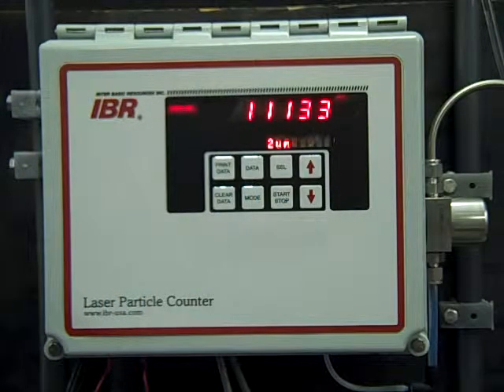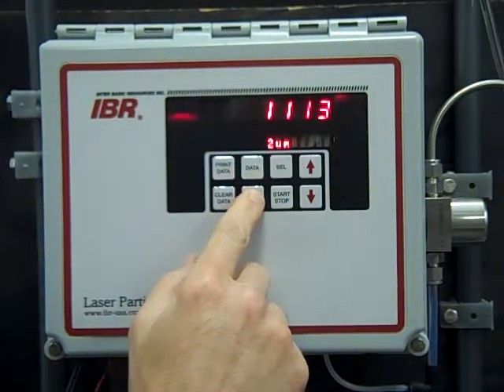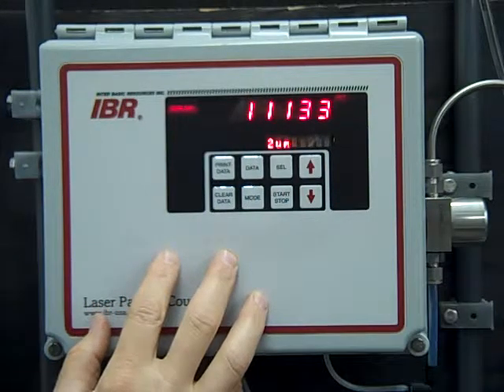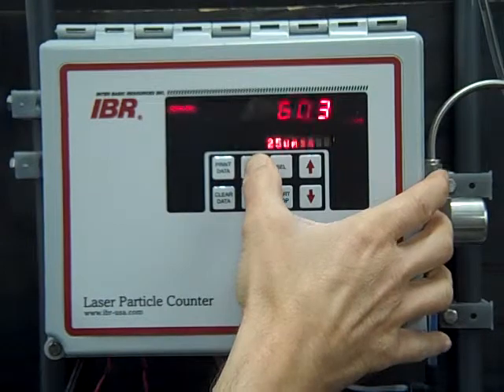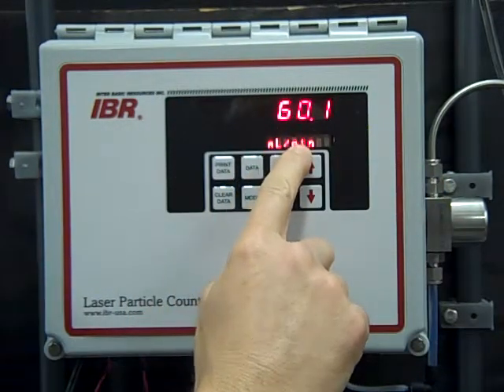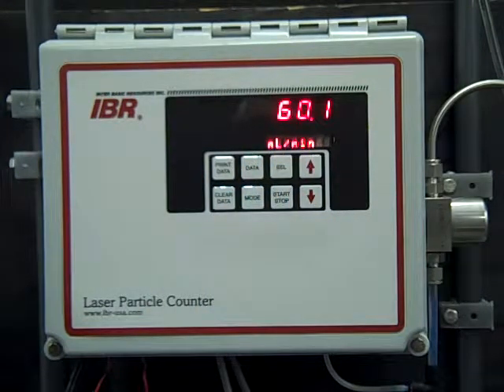For a demonstration purpose, to describe the difference between total counts and counts per ml, I've set the particle counter to run at a 10-second count cycle. Notice the flow rate is at 60 mLs per minute, which means 60 mLs per 60 seconds, which means 1 ml per second.